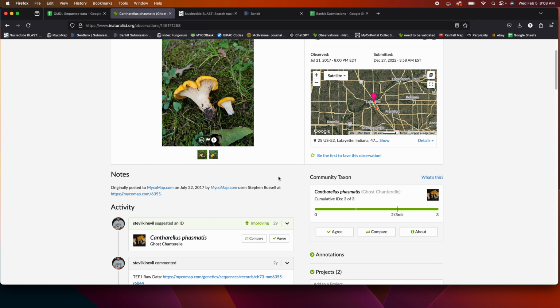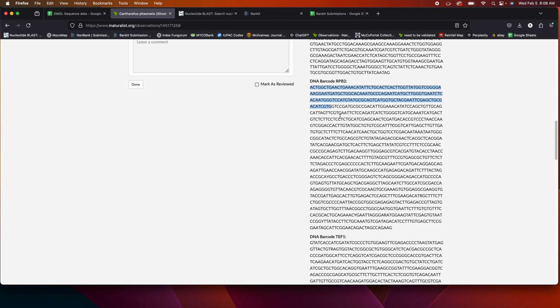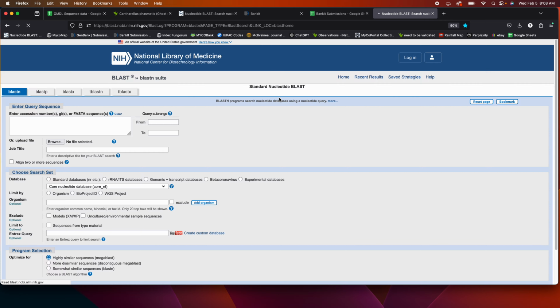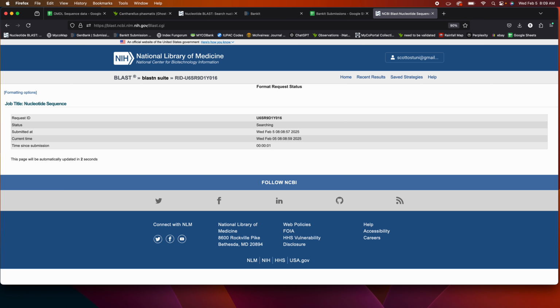All right, so I'm going to steal one of Steven's RPB2 sequences and upload that to Bankit. So first thing I'm going to do is BLAST it. And while that's happening, I'm going to open up Eugene.